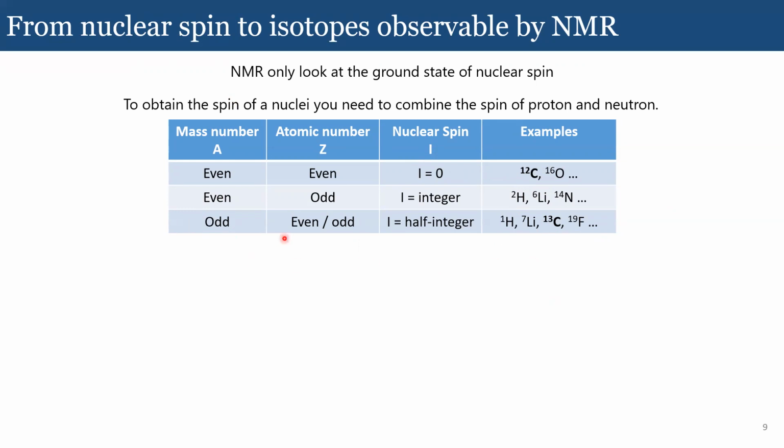1/2. If you want to play with these rules, I'm not going to extend anything here, but the nuclear spin, you might know, is a combination of the proton and neutron, which themselves have a value of spin. When you add them up to form the structure of the nuclei, you end up with either all of them canceling out, or that's not the case and they add up. So I hope that answers your question too.